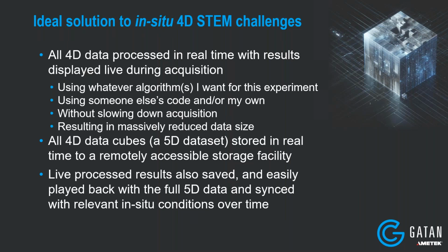With the full 5-dimensional data synchronized as well, and also any in situ conditions, right? So if I'm doing an in situ experiment, it's not enough for me to see the in situ 4D STEM data if I don't know what the in situ conditions were at each moment in my experiment.